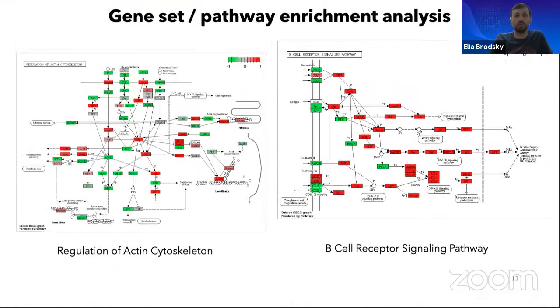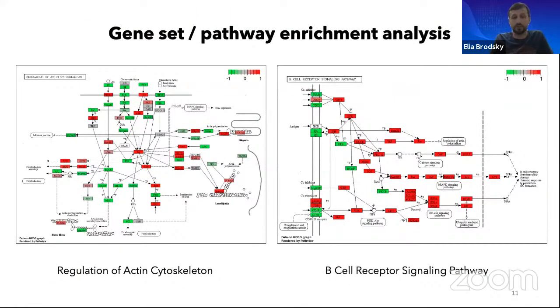Ultimately, though, we will talk about gene set and pathway enrichment. We'll talk about how some of these analytical methods can provide us with important values to differentiate between different gene sets that could be annotated. Thankfully, we have a lot of annotated resources, especially for human and mouse animal models. And so we can start using some of these references to really understand the biology behind what's going on. So we'll talk about some of the things that go into biological interpretation.